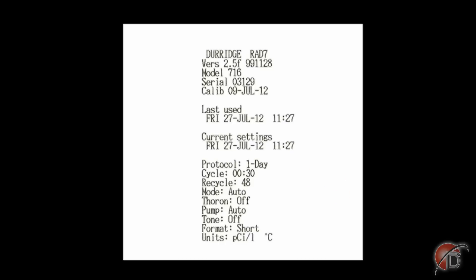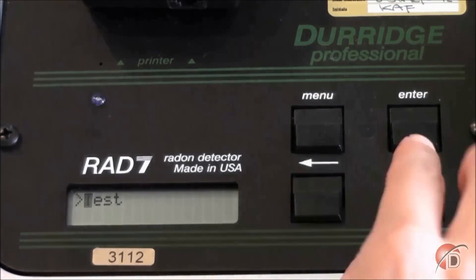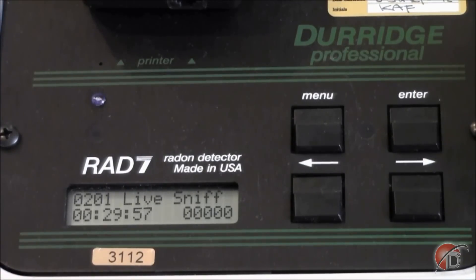These settings include parameters such as how long each cycle will be in minutes, the RAD7 mode, and our manually entered tone and format options. To begin the measurement, from the test screen arrow over to Start and press Enter. You should hear the pump start. The pump will keep running until the relative humidity drops below 10%, after which the pump will run for 5 minutes at the start of each measurement cycle, and then for just 1 minute every 5. For the next 24 hours, your RAD7 will take measurements using the one-day protocol we've programmed into it.